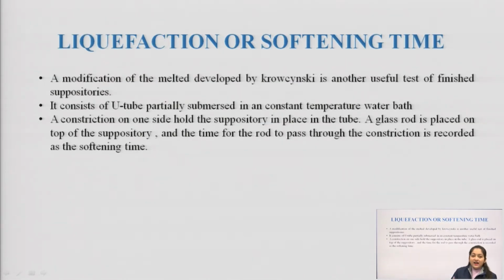Now, let us understand another test, that is liquefaction or softening time. As we are discussing suppositories, the melting of the suppositories is a very vital step in determining the dosage form. So, softening or liquefaction of suppositories is actually a rate determining step here. It is very important to understand at what temperature our suppository is going to become soft or liquefy itself, so that it becomes a portable agent to deliver its constituents into the surrounding area and to treat the particular disease. So, let us understand liquefaction or softening time.